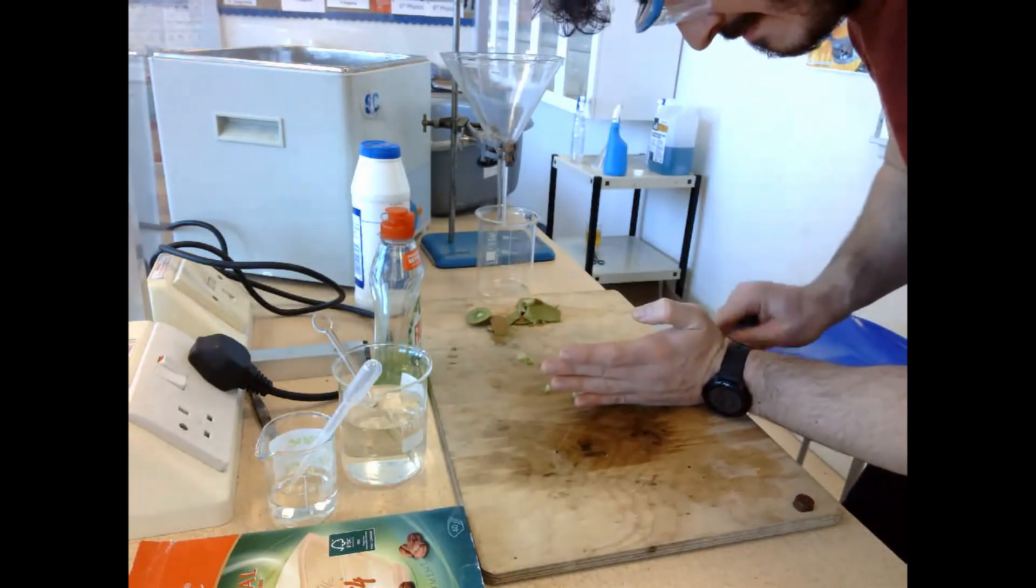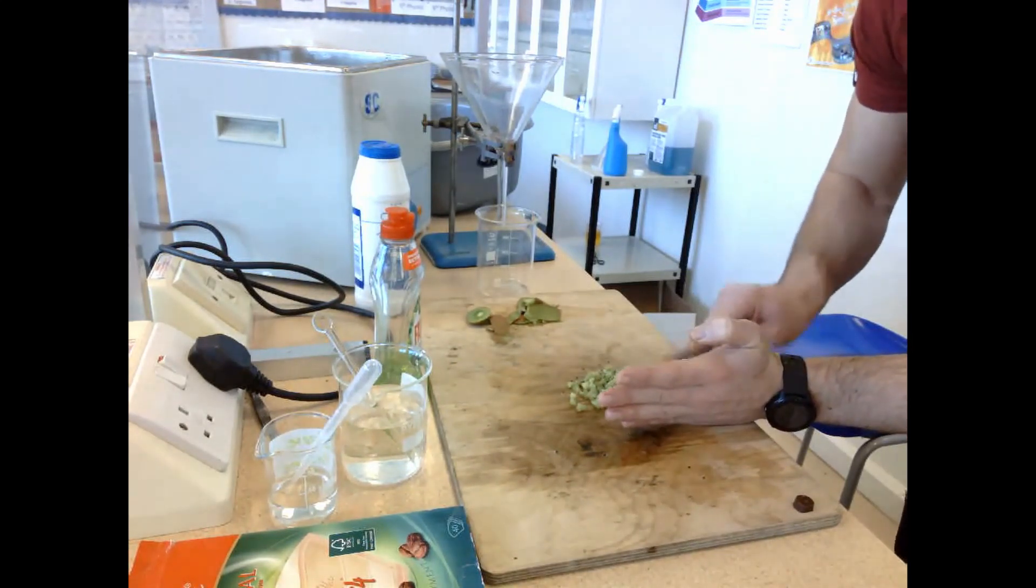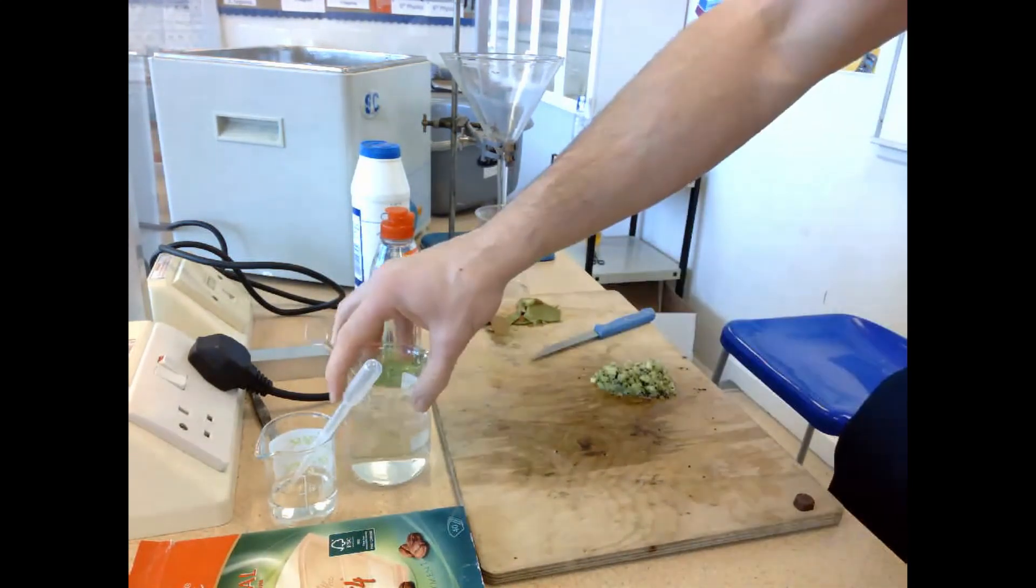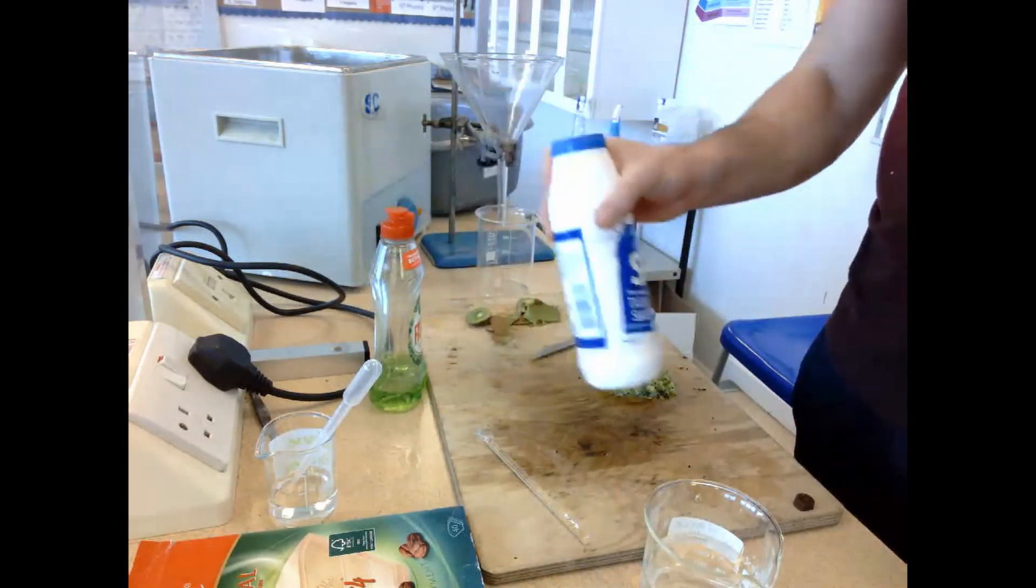Once it is chopped up into really small pieces, and we're pretty happy the cell contents will be released, we're now going to add salt into a water solution. The salt is there because it's going to cause the DNA to clump together.